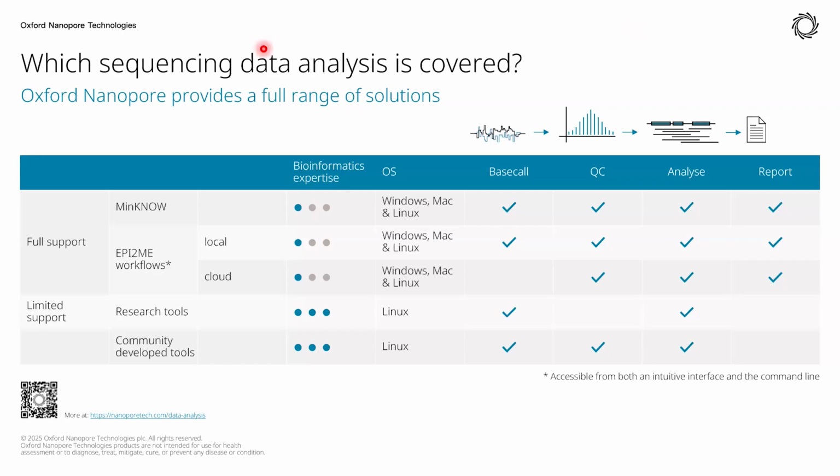Matt, do you want to take this question? Yeah. So are you asking about doing extra analyses in MinKNOW? No. I'm asking about, we analyze the data on the machine, and then somehow we want the counts per cell for any gene in a skinny format or whatever, similar to what 10x provides.